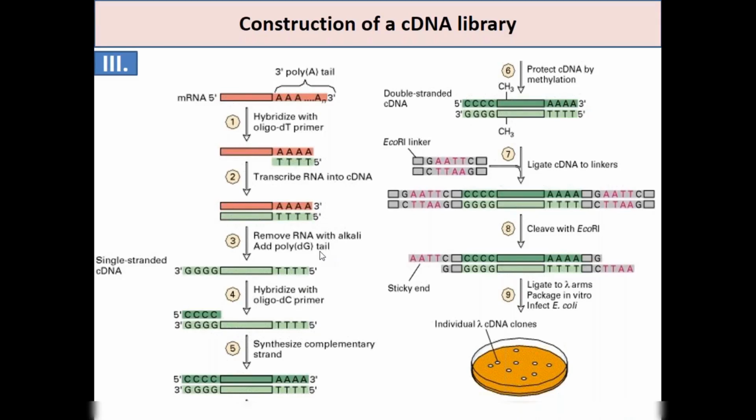If the linker is not there in cDNA, it cannot be cloned into the vector. Sticky end, restriction site.